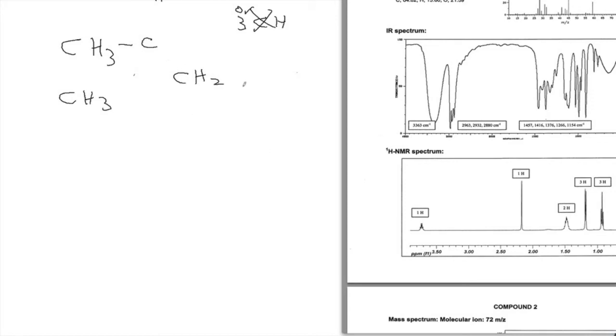So in fact, now we know that this peak is on the carbon attached to this one, if you see what I'm saying. Because this is the only thing with 2 hydrogens? Yes. Okay. So that's how we could use the splitting here. We know this is the CH2 group based on this splitting.